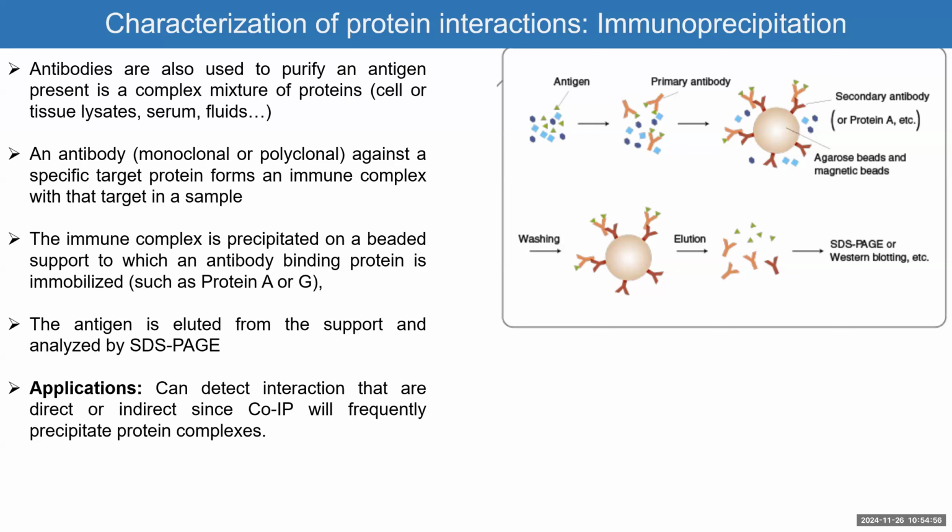Very good answer, Gary. So your colleague was asking about the staining. Which one would we use? Silver staining is the most expensive and the most sensitive. Coomassie staining is less expensive and less sensitive. Ponceau is quick because you can use it on the membranes.